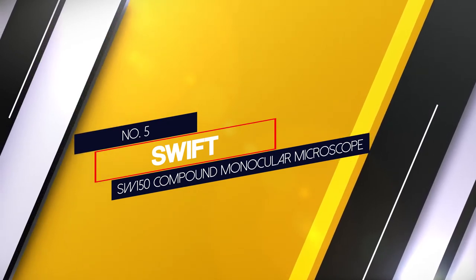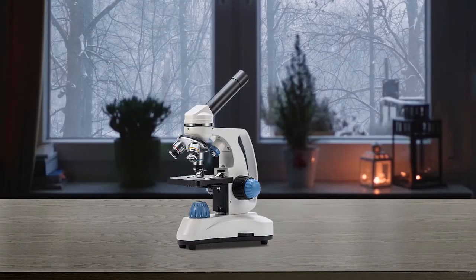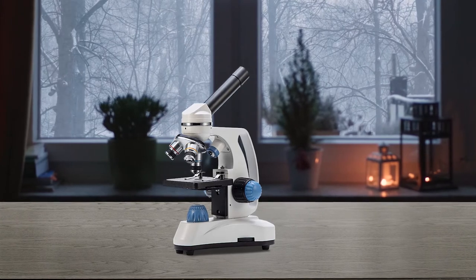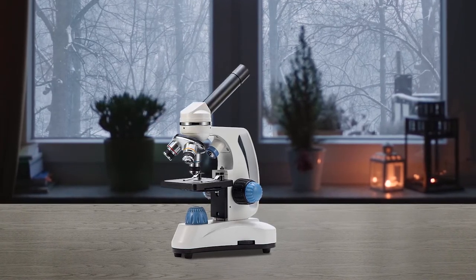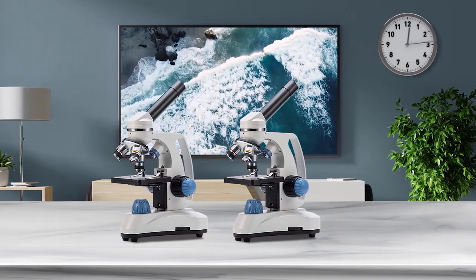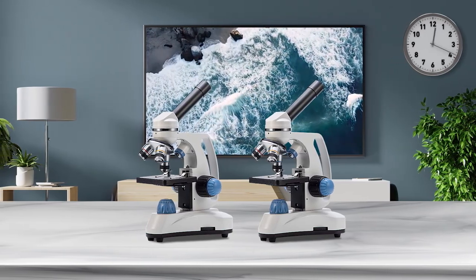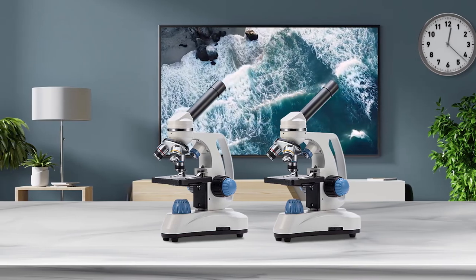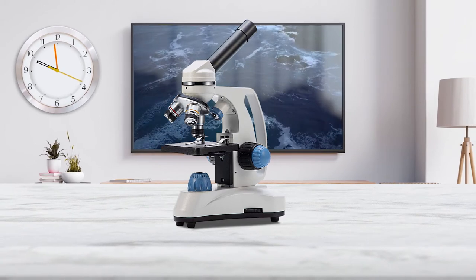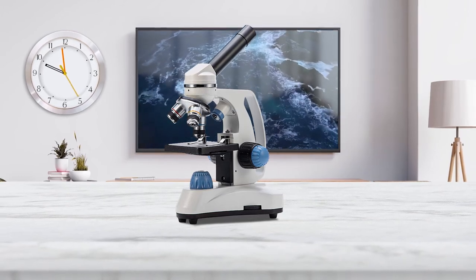Number 5: Swift SW150 Compound Monocular Microscope. This microscope is designed for middle school students and beginners to introduce them to the fascinating world of microscopy and the life sciences. The magnification is very good and can be raised up to 1000 times. It also provides a 360-degree rotatable head like the AMscope M150CI. It has 2 LED light sources, and the best part is that this microscope comes with 25 pieces of prepared slides of plants, animals, and insects with labeling.